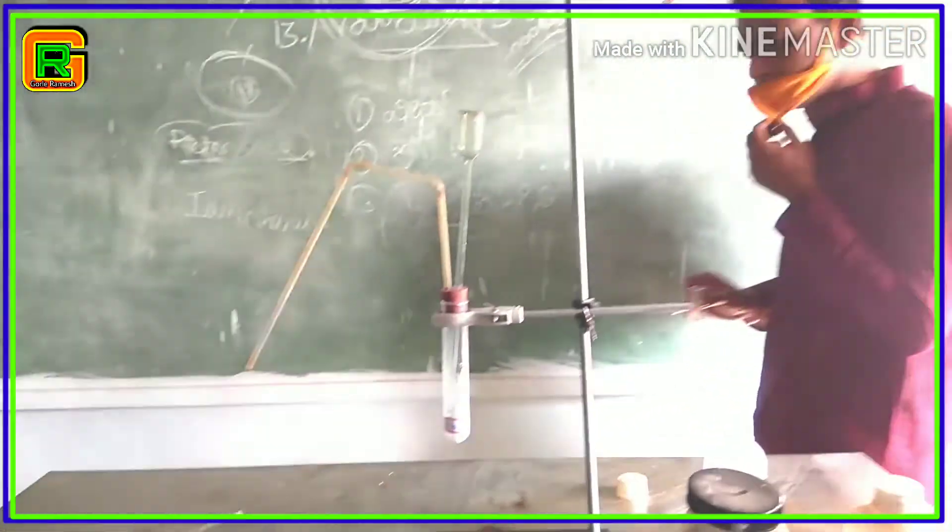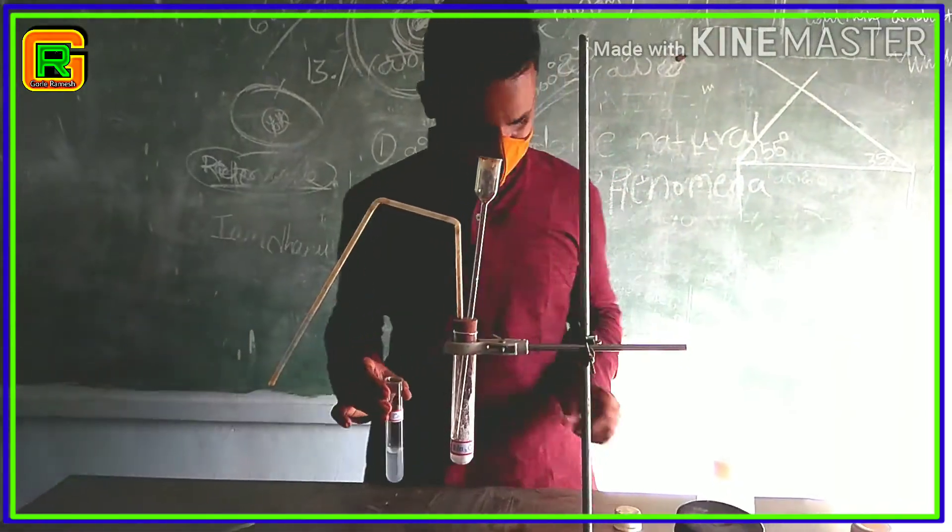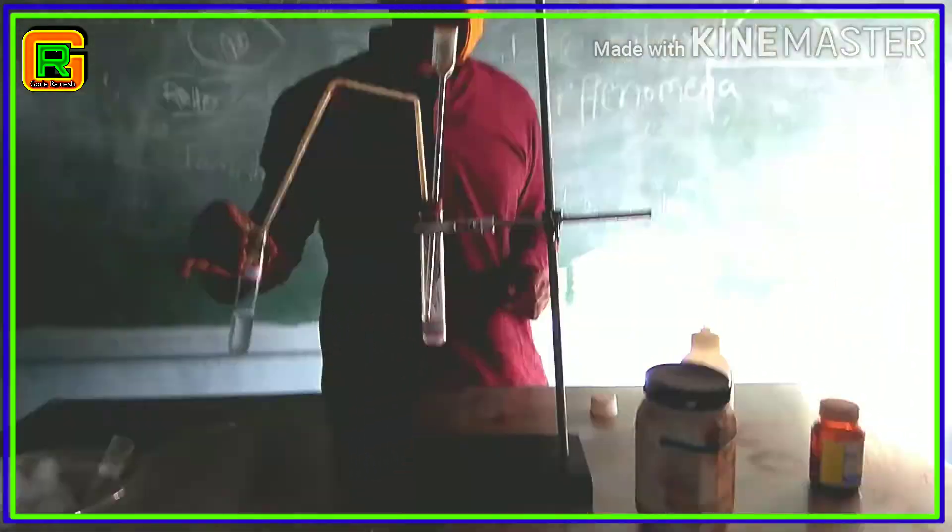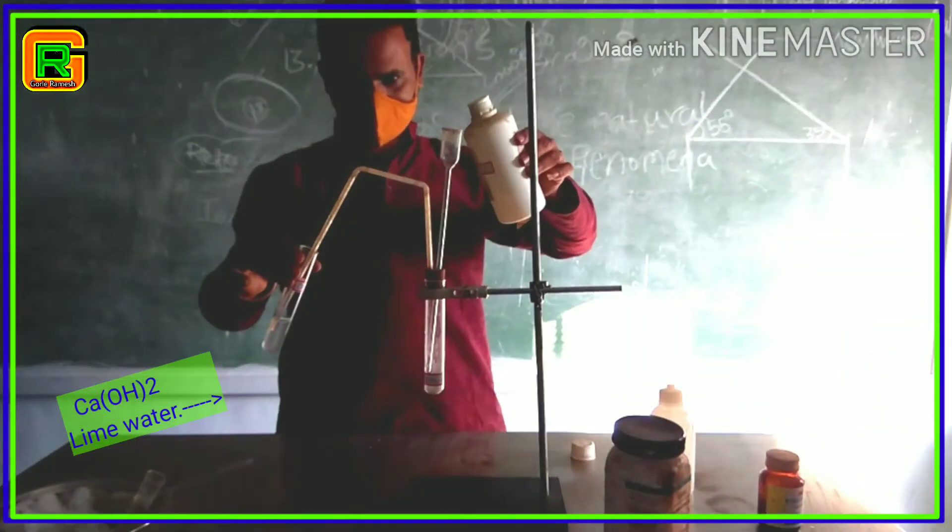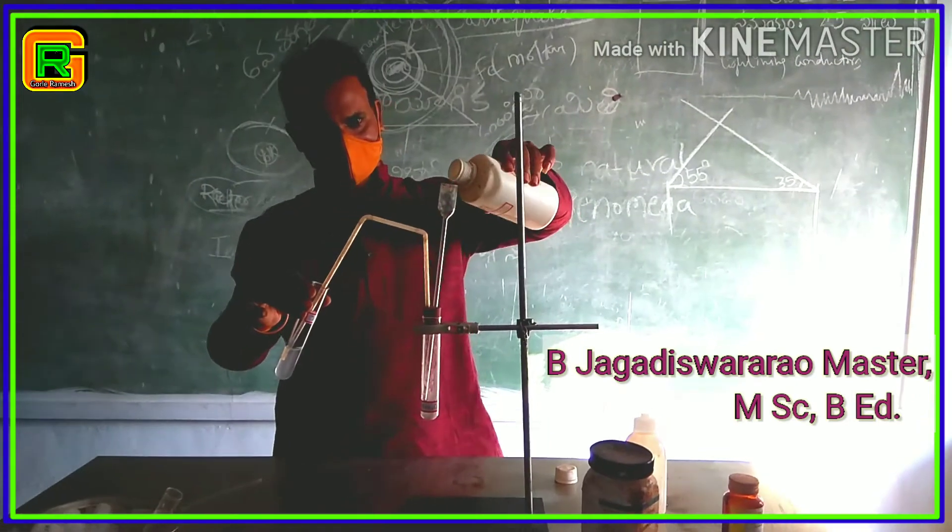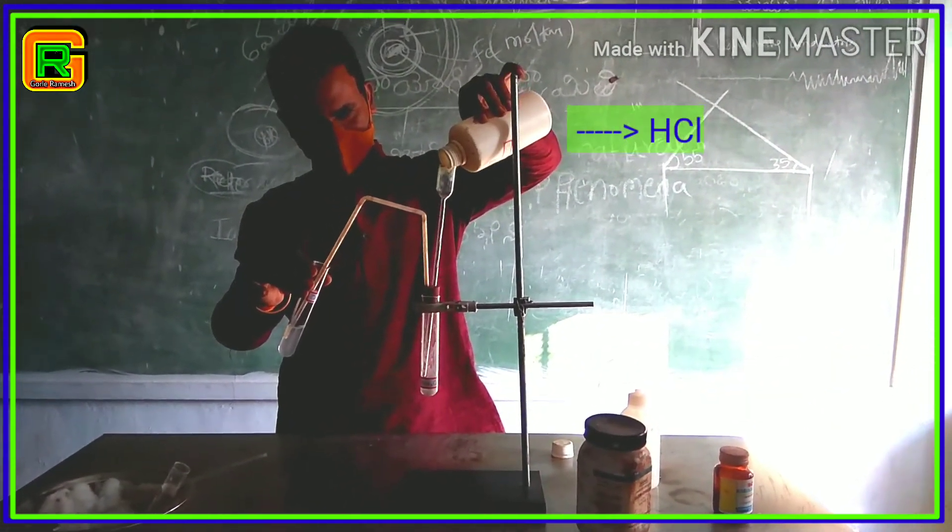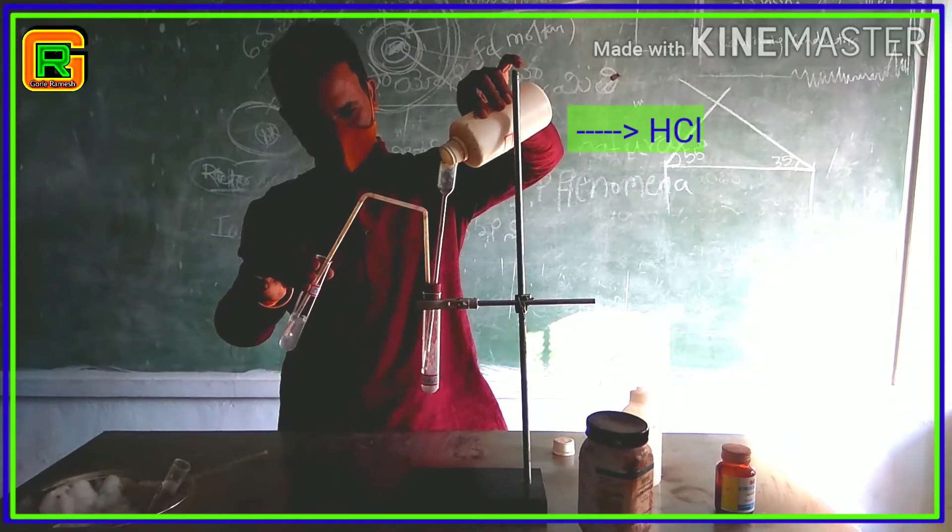And also, ready with lime water in the other test tube, that is calcium hydroxide solution. Let's keep the other end of the delivery tube in the lime water as shown here. Now, add sufficient quantity of dilute hydrochloric acid to sodium carbonate through the thistle funnel.